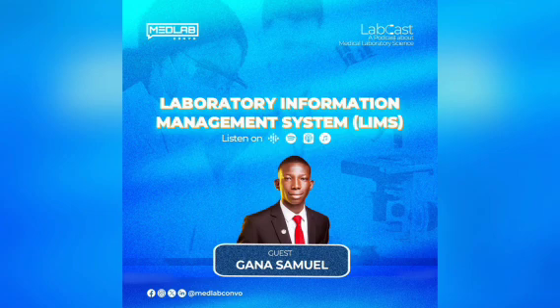Well, let me ask, right? As much as we're trying to educate people, we're also trying to proffer solutions. So for laboratories with limited budgets, what do you think are the most essential LIMS features they should prioritize when choosing a system? There's a lot to do in LIMS and a lot of things attached to it, but little things that would help them in their own record keeping. What do you think that they can prioritize?